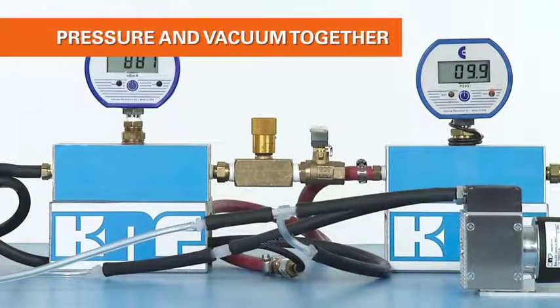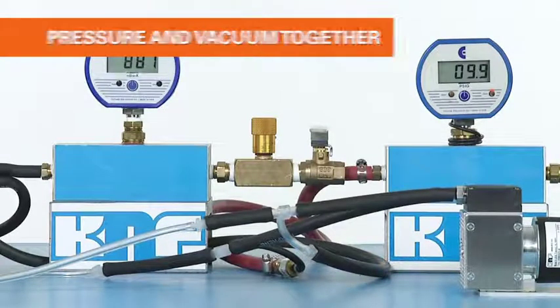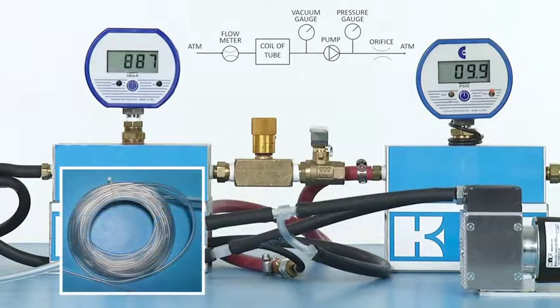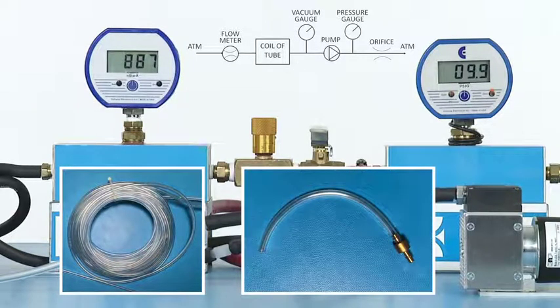What happens to the flow rate when there is restriction on both sides of the pump? This example will demonstrate how to use the flow curve to estimate the flow rate performance of a pump when both vacuum and pressure conditions exist. Here, a long length of tubing with a small inside diameter is connected to the inlet side of the pump, and a small restrictive orifice is connected to the outlet side of the pump.